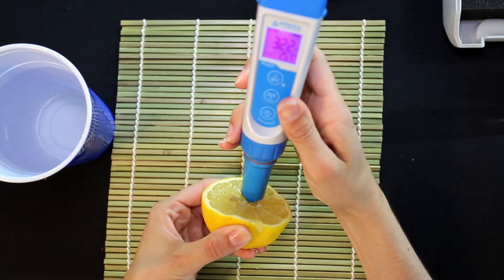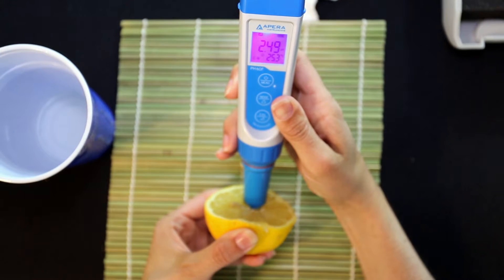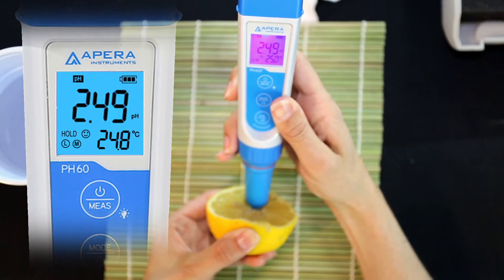Put the probe into the tested sample. Let it stand still. Read the measurement until the smiley face or hold icon comes up.